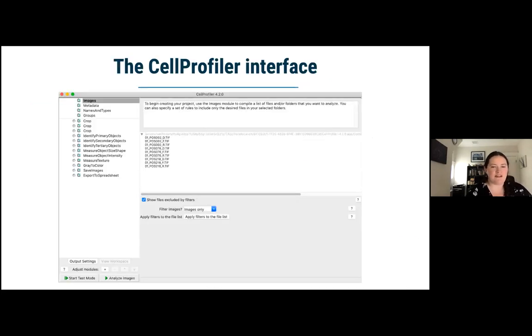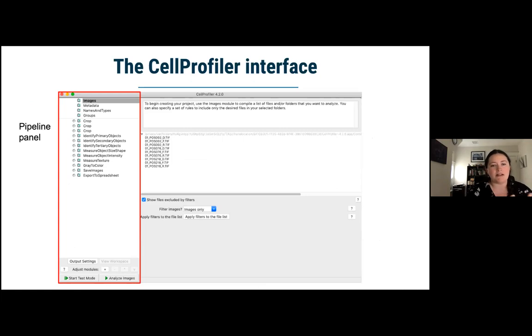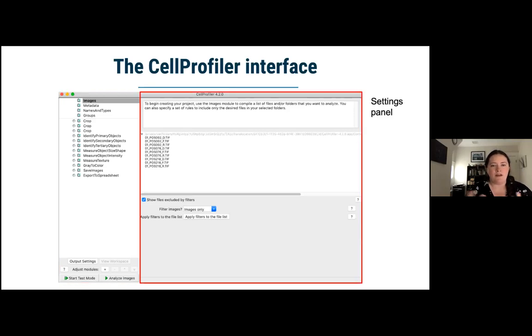Again, I know you did a session on CellProfiler last week, so I won't go into this in a ton of detail, but in case you've forgotten or weren't there, what also makes CellProfiler pretty special is the idea of the image analysis pipeline, the idea that you're going to create a single workflow that's applied to as many images as you have. And that could be one, or that could be over 1 million. CellProfiler will work exactly the same way, whether you have 1 or 1 million images. And that's what makes it really valuable for screening scale and high content. Each module is then configurable when you're working in the GUI mode so that you can go through and change the settings to customize them to fit all of the principles and practices that I just mentioned.